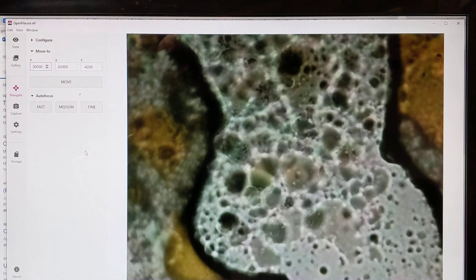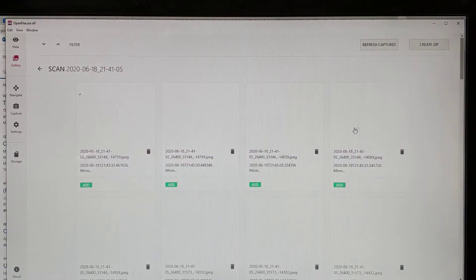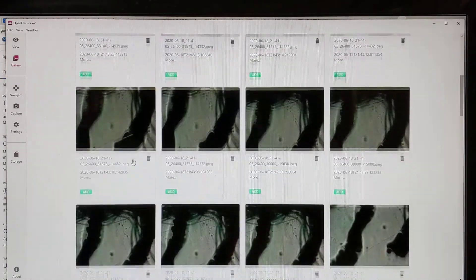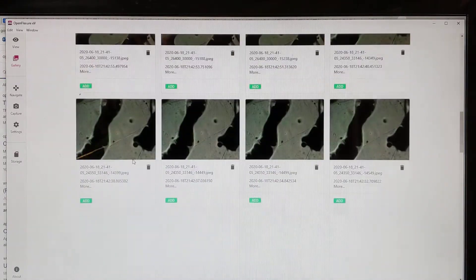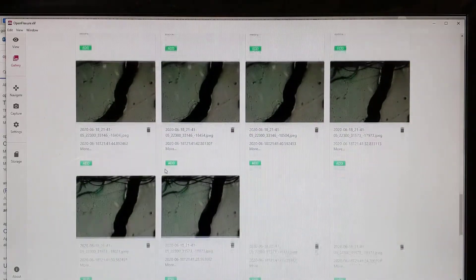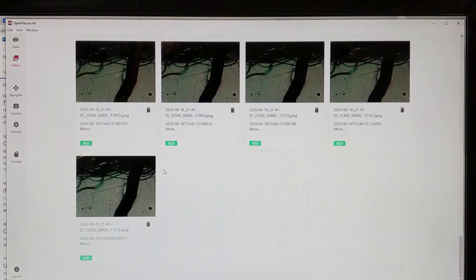On something like a mosquito, I have some photos previously. This was actually done as a scan, and when you scan in, it will save all of the images that it scanned in for that series. At each step of the way, it will scan in however many Z levels you ask it to.